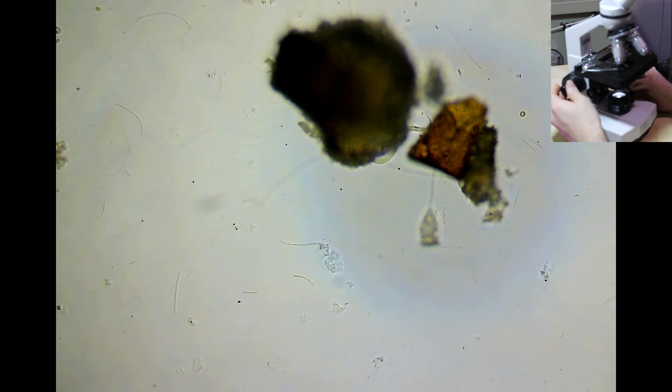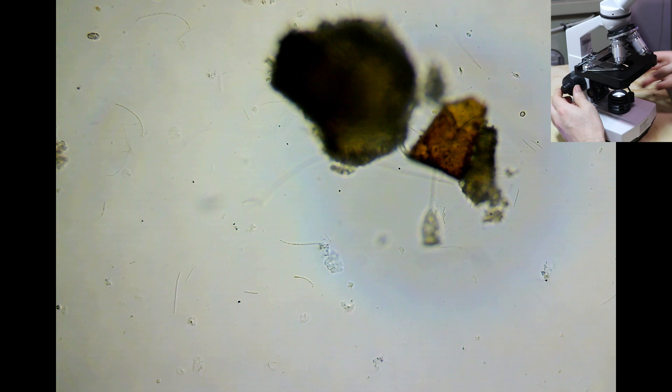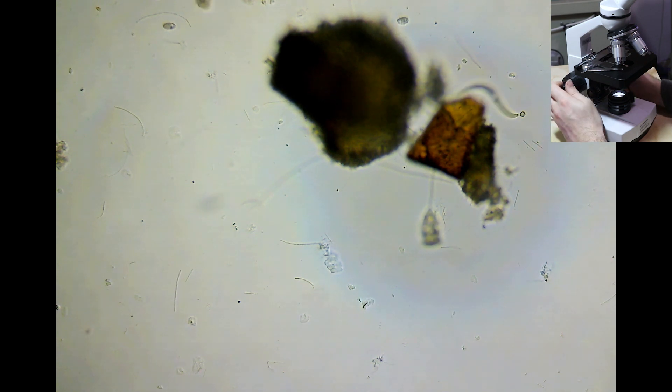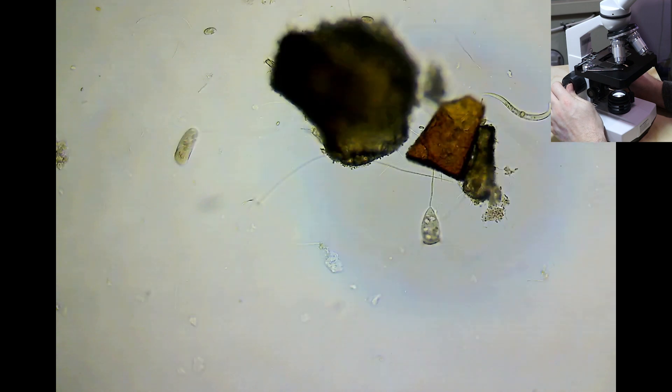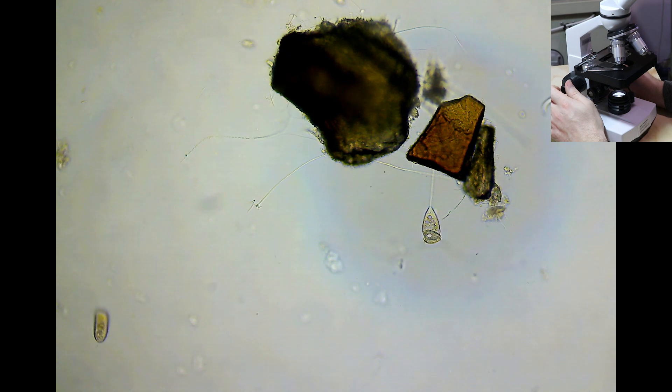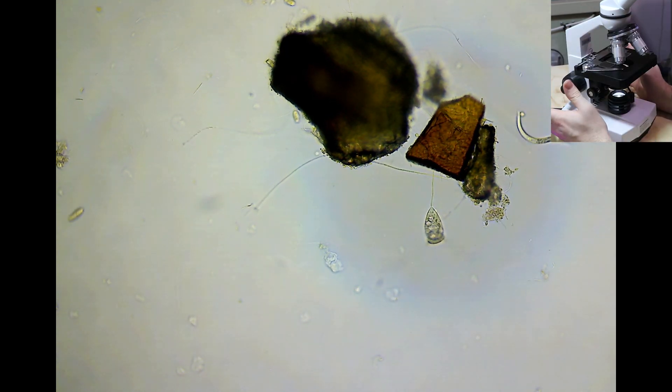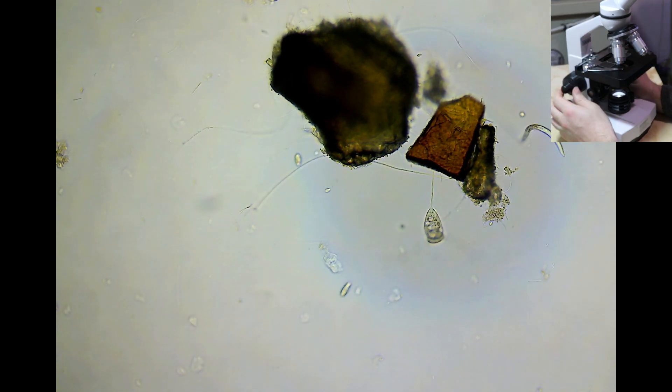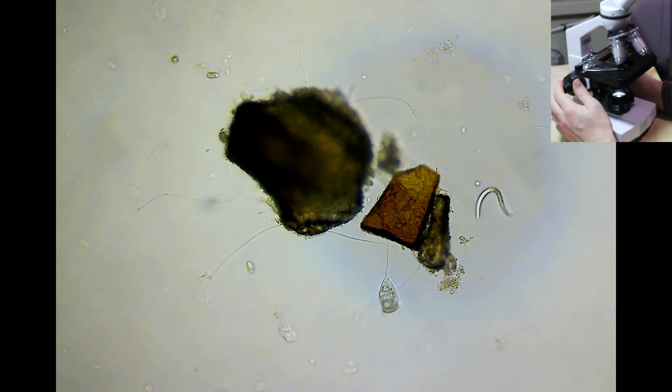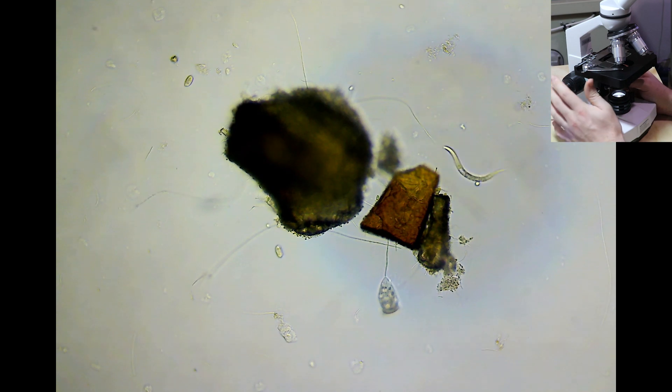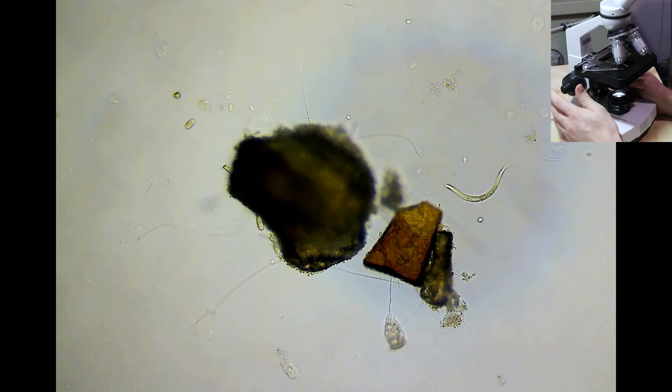I think I've just come across a worm in this muck here. He's hiding under the muck. You can just make him out. He's wriggling about like crazy. In fact, there's all three things there: dots, acorns, and a worm. Those are the three most common things. That is a big dot. They're usually the three most common things that you'll find, and they're really good to find. They're a really good way to practice using your microscope. That's literally the perfect shot right there, showing how much things can live in your drain.